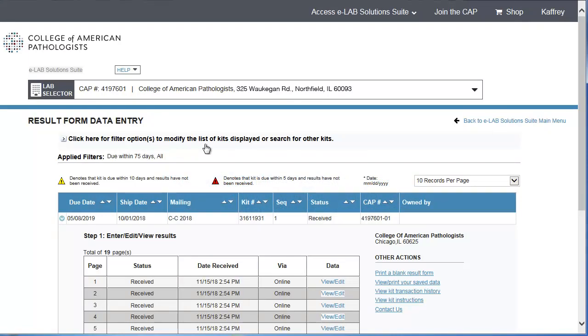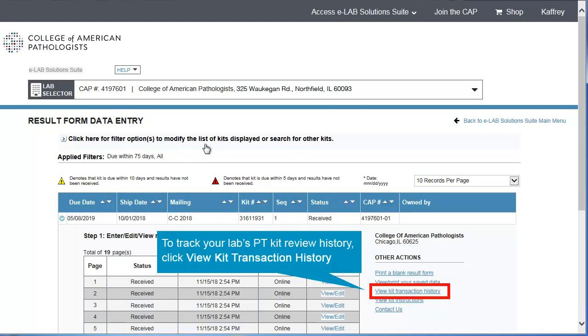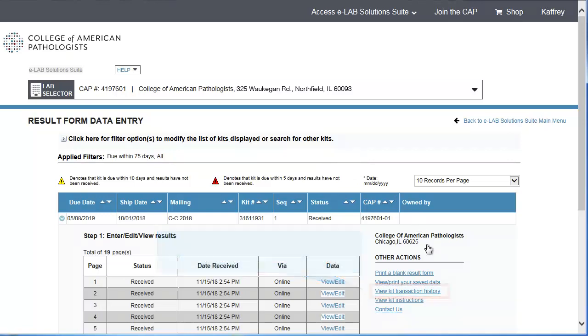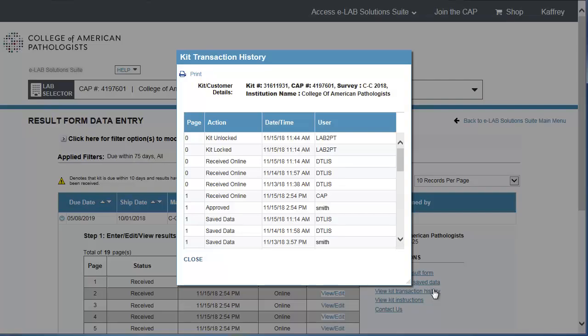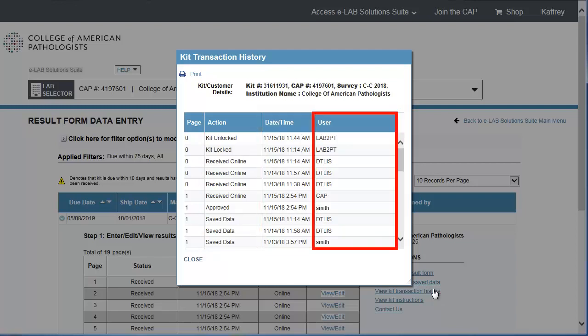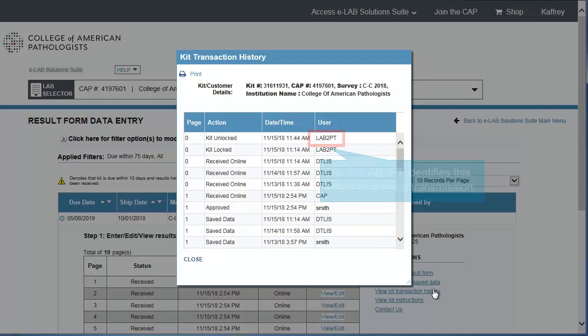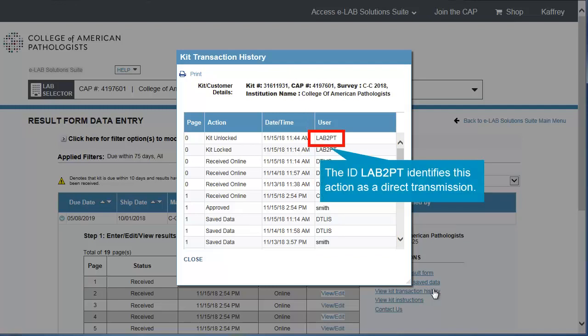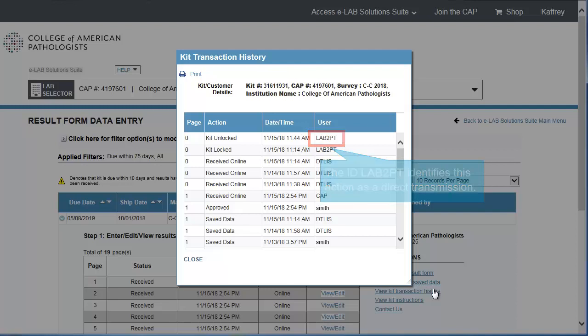At any point, you or another eLab Solutions Suite user can track your lab's PT kit review history by clicking the View Kit Transaction History link. The Kit Transaction History pop-up window shows an audit trail for each page in a kit, including each action taken on that page, the date and time of the action, and the ID of the user who performed the action. The ID Lab 2 PT identifies this action as a direct transmission.